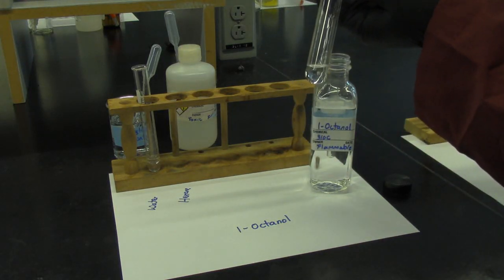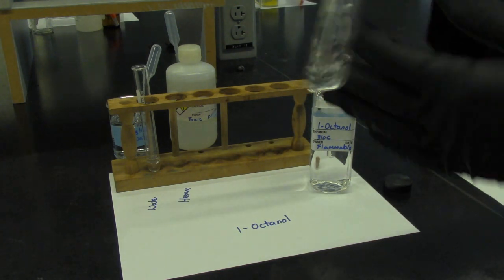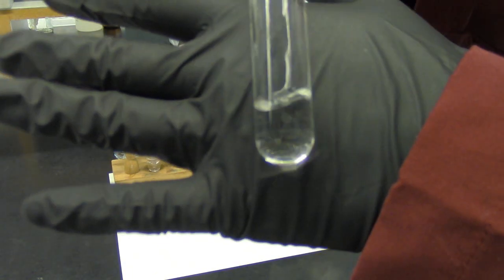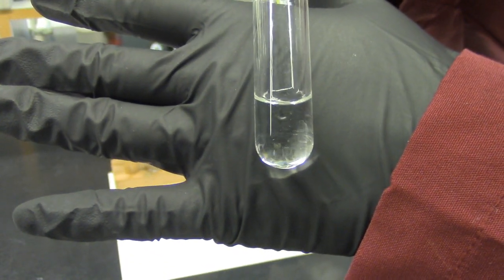Six, 7, up to 20, with 20 drops of octanol and hexane. Shake, shake, shake. Write down the observation.